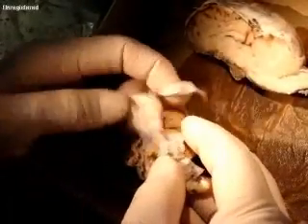So you can pull this off, and I'm going to try to do it. This is always a challenge without cutting off or tearing off the optic nerve.